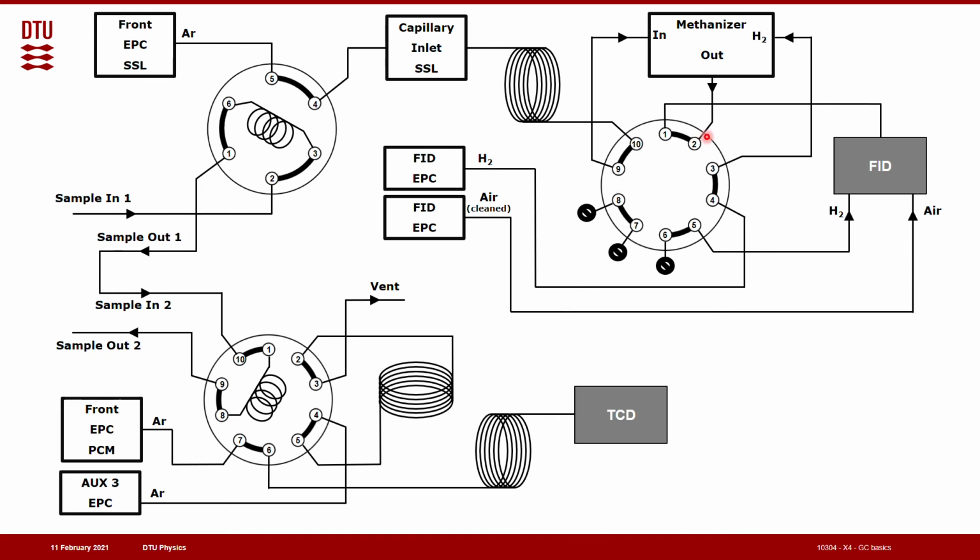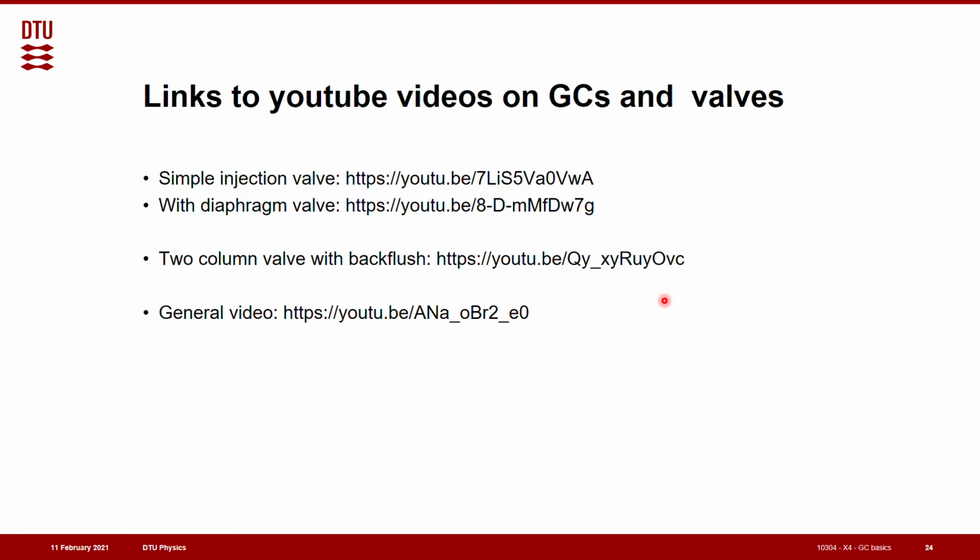The next thing is actually that here we should turn off the methanizer. And then we're back to idle.